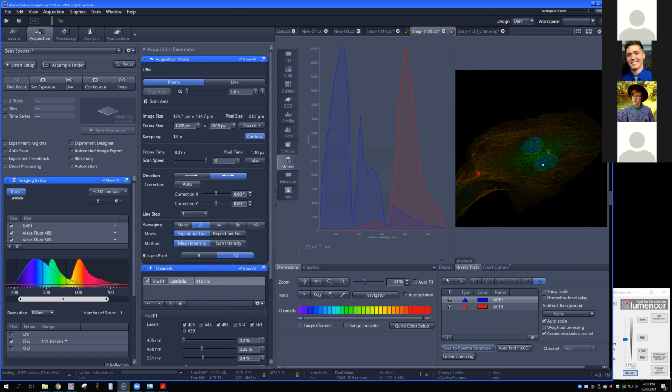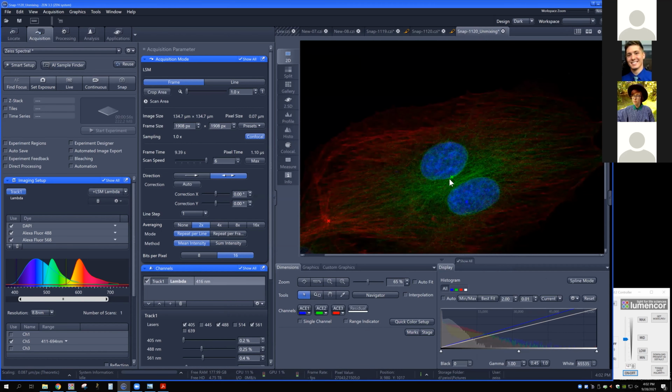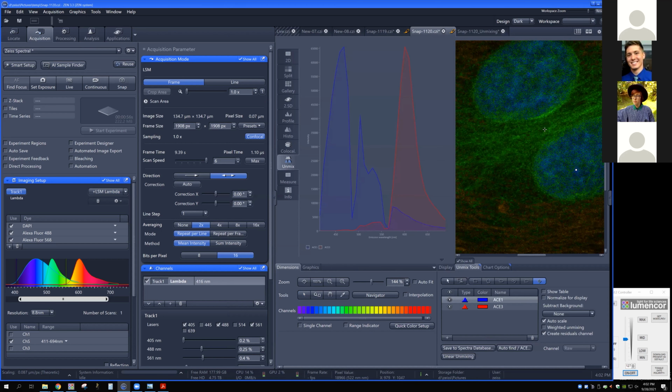Now what I'm going to do is see if I can find a better green, and I'm willing to bet that I know why it chose where it did, but I'm going to give it a shot anyway. So what I want to do is try to find a region that has green without blue and without red. If I turn off my green, I can see where there was hardly any red, which is all of these regions right here. I'm going to try that, but I'm willing to bet that it's going to end up getting a little bit of red as a result of that.